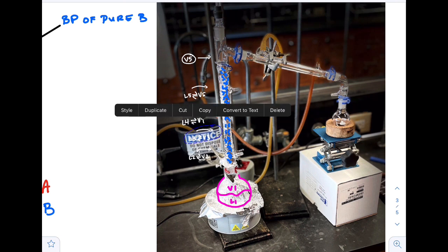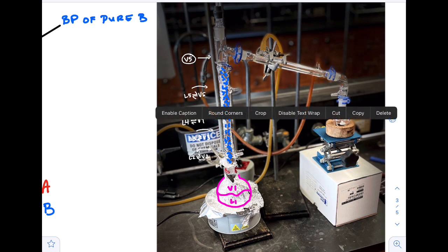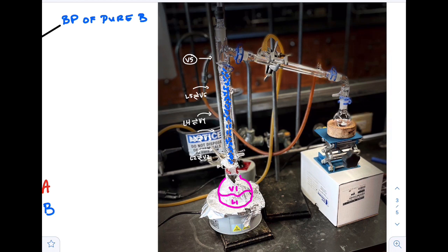So I'm just basically trying to show you that within this column right here with the stainless steel sponge, the liquid or the ethanol solution in our case is going to go up. It's going to go into the vapor phase. It's going to condense over and over and over again. I've only drawn 5 examples here, but it could be a lot more. It could be like 1,000 times, or it could be 20 times, or whatever. It just depends on your setup.